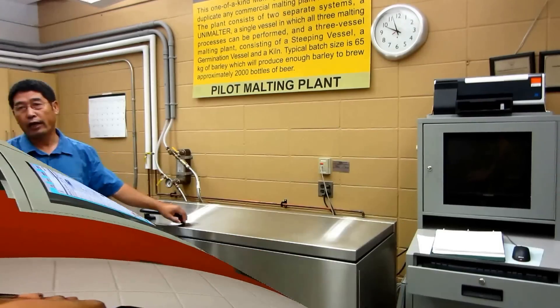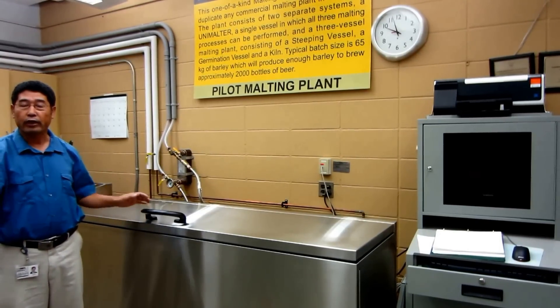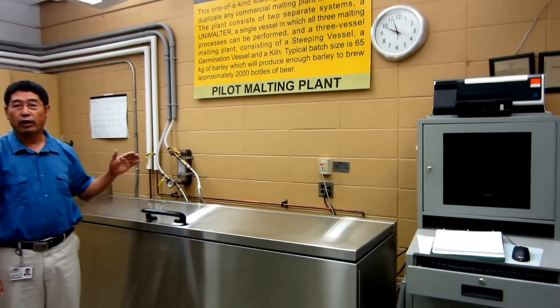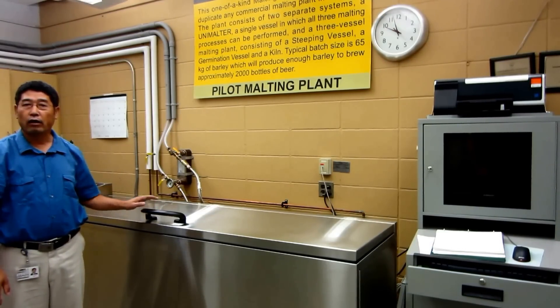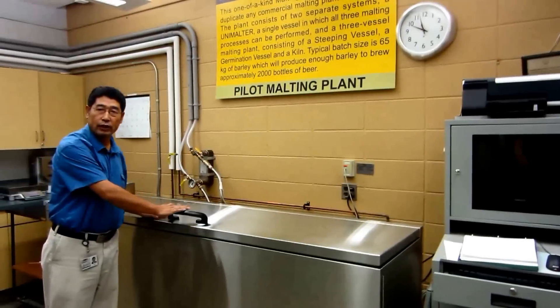In addition to that, it is also a pretty good training tool for anyone — for beginners, and even for people working in a big operation. Before you want to try any new variety or new processing condition, you can work with this facility.